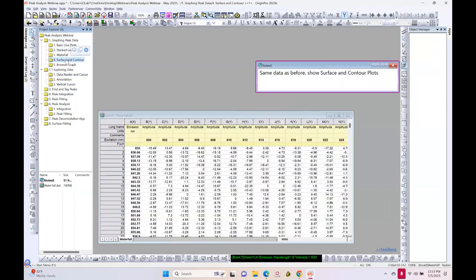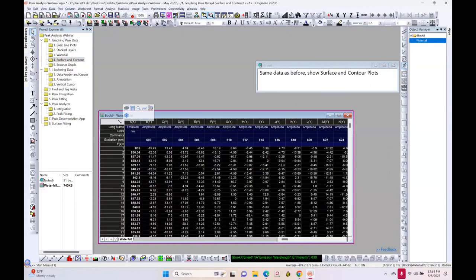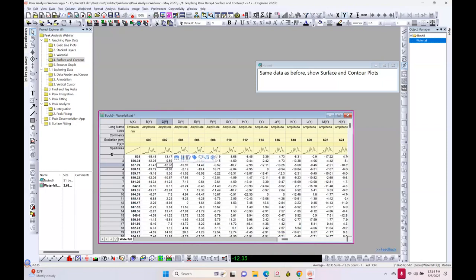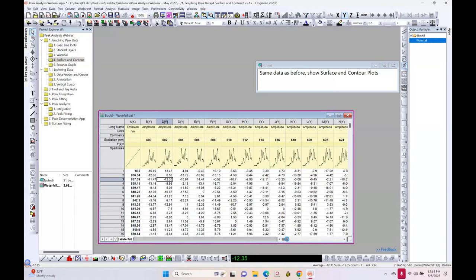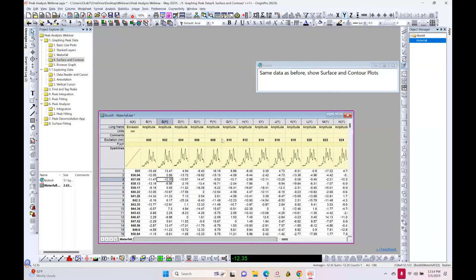Now let's look at some other data — this time an excitation emission map with many columns. The excitation wavelength and emission wavelength form the axes, with amplitudes as values. You can turn on sparklines in Origin: every column is represented by a small graph shown on top of the column, so you can visualize data without even plotting it. You can simply scroll the worksheet to see how your spectra evolve as a function of excitation wavelength.